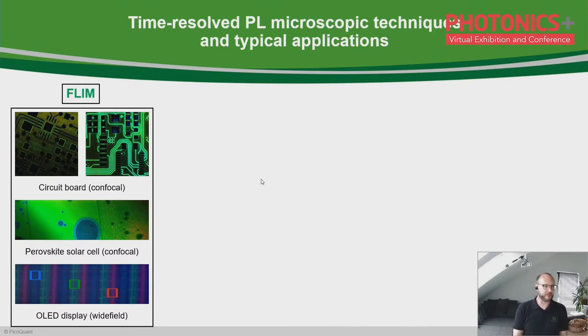For instance, here you see there's a huge blue circular spot inside. This is an air bubble. So the preparation process was not completed successfully, or there was a problem in this. So you get it. It's not a homogeneous structure. With a scan over the area, you get the idea. Well, you have to optimize it a little bit.